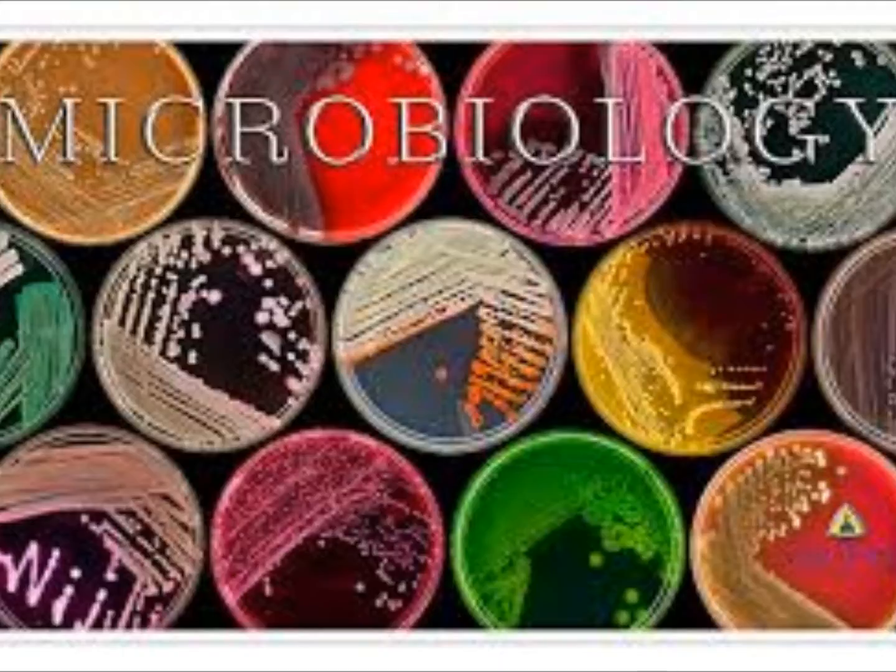Remember, you're gonna wanna do color, size, and hemolysis at the minimum. The other characteristics, if you can tell them and it's significant in helping you identify, are useful, but at minimum it's color, size, and hemolysis off the blood plate.